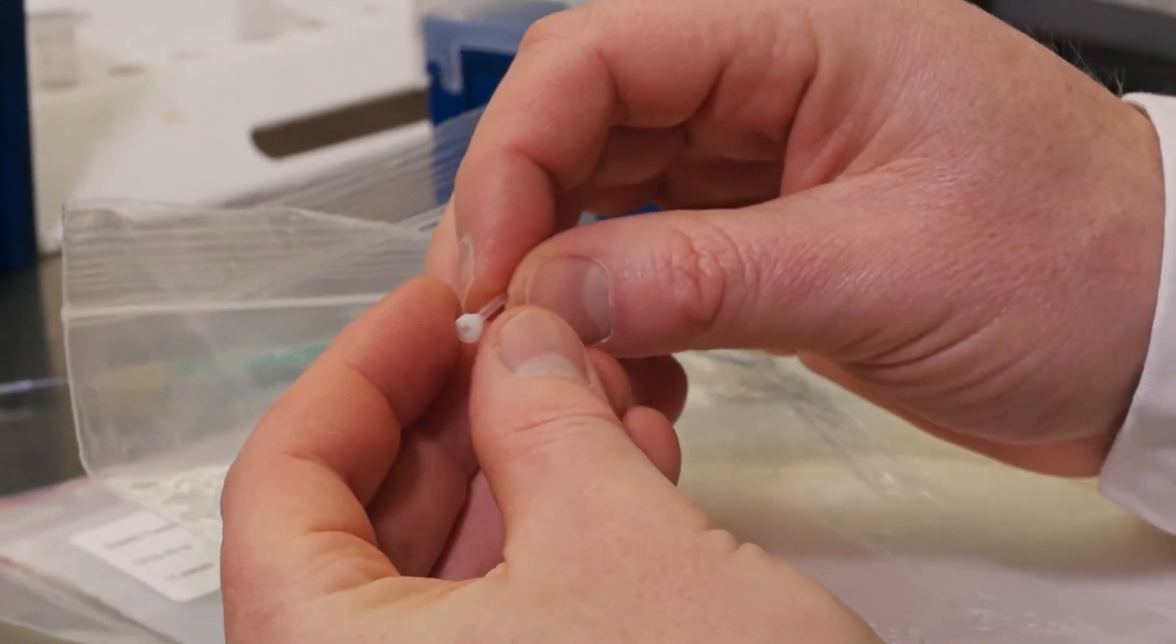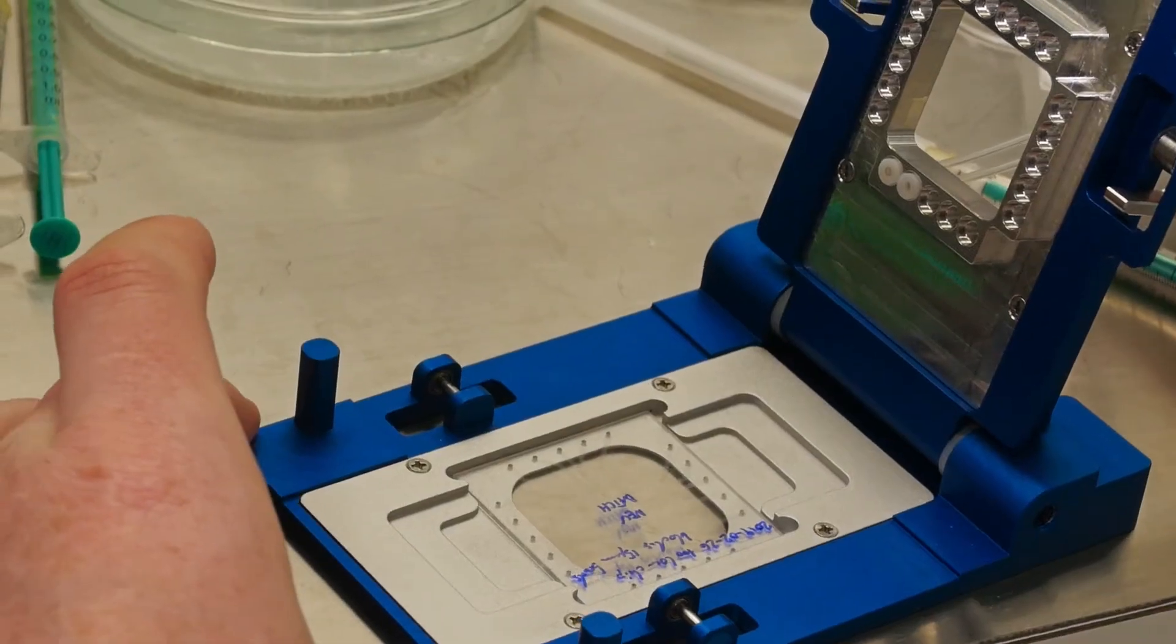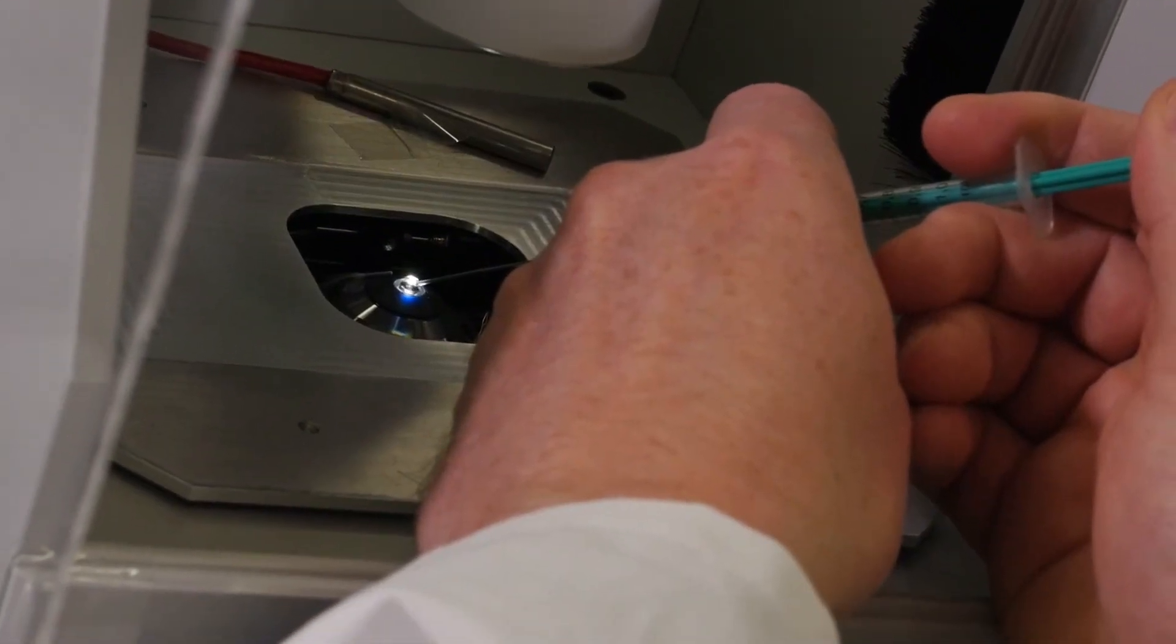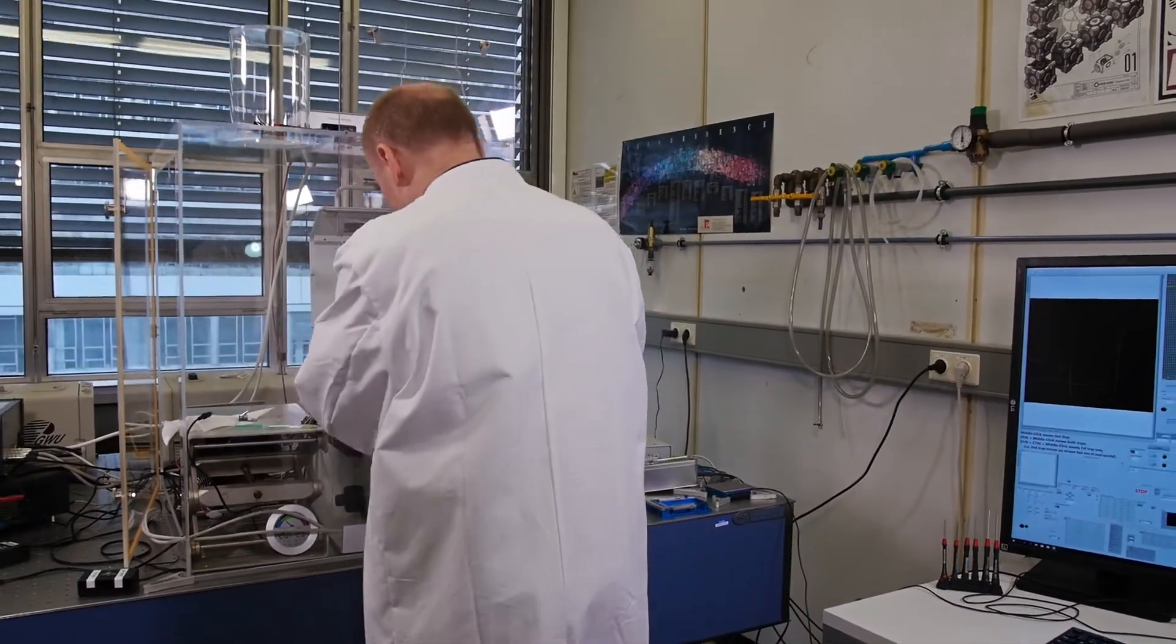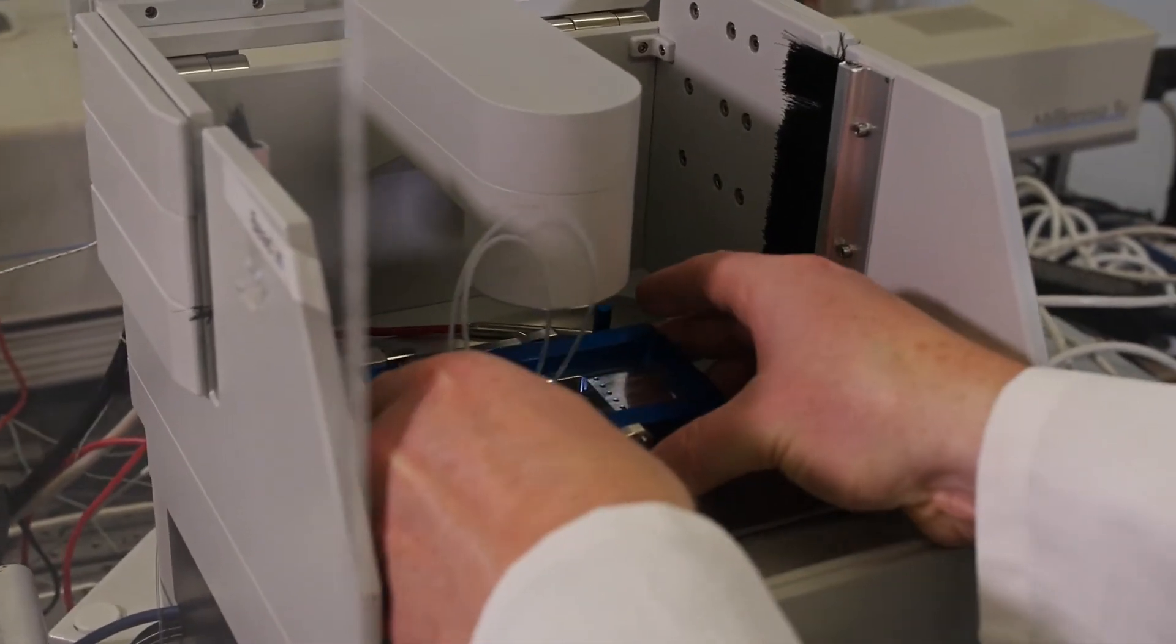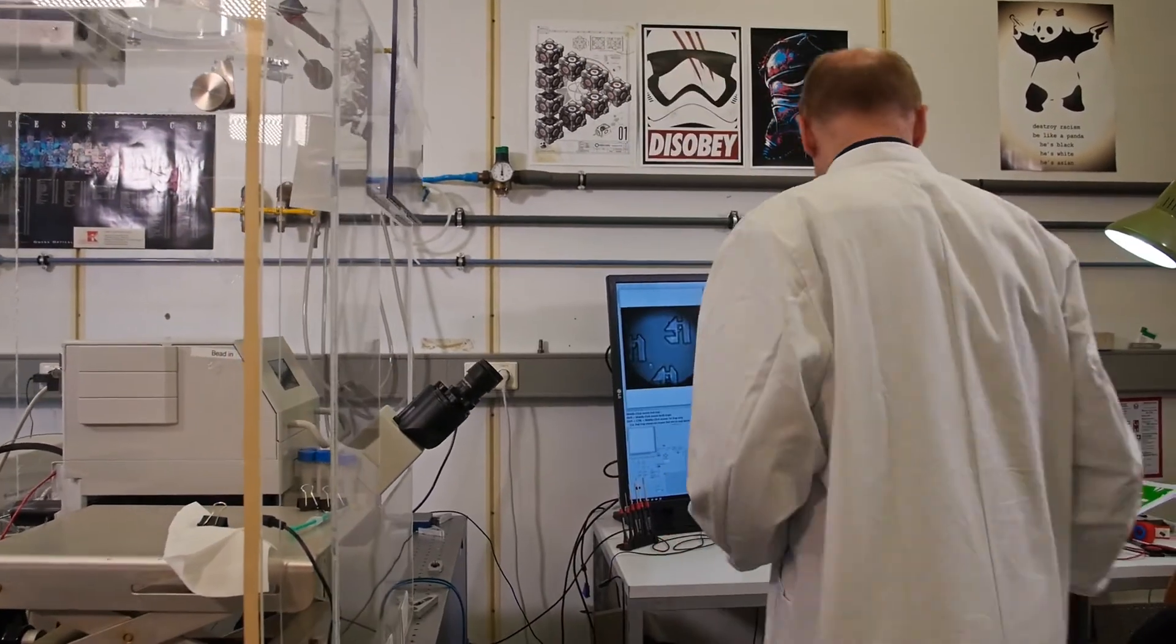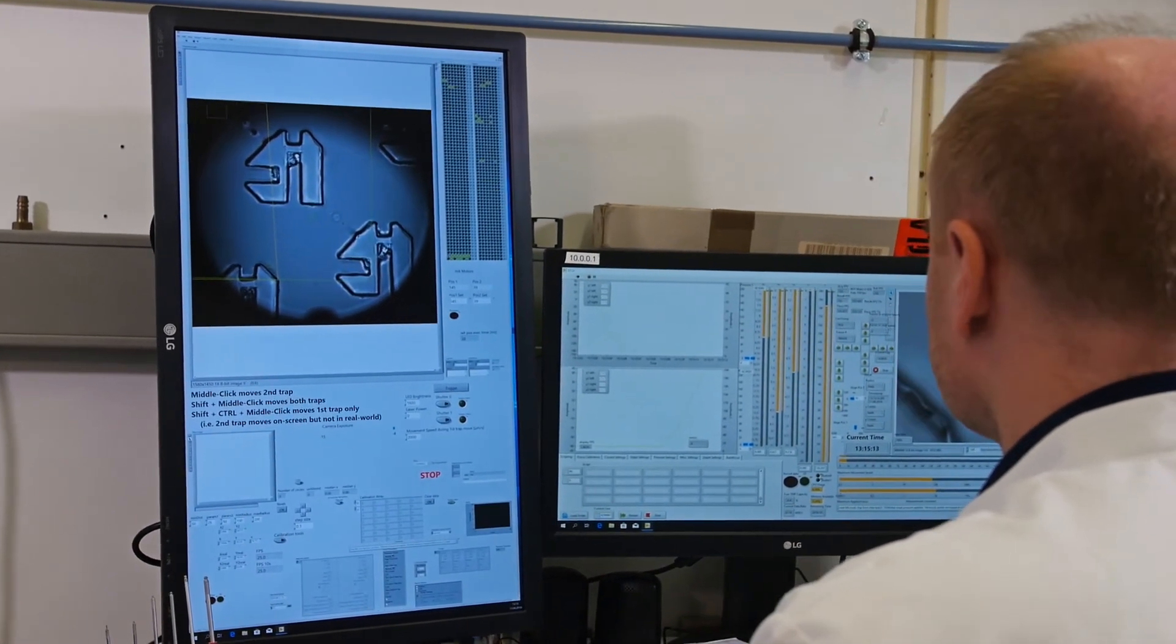The core element of the automated elasto-tweezers instrument is a dual optical tweezer with two independently controllable optical traps developed by IronOvation. For evaluation of the cell's elasticity properties, complexes are formed between one individual cell and two microbeads, the two microbeads being captured by the two optical traps. Pulling or pushing on the microbeads results in deformation of the cells and by quantifying the amount of cell deformation, its viscoelastic properties can be derived.